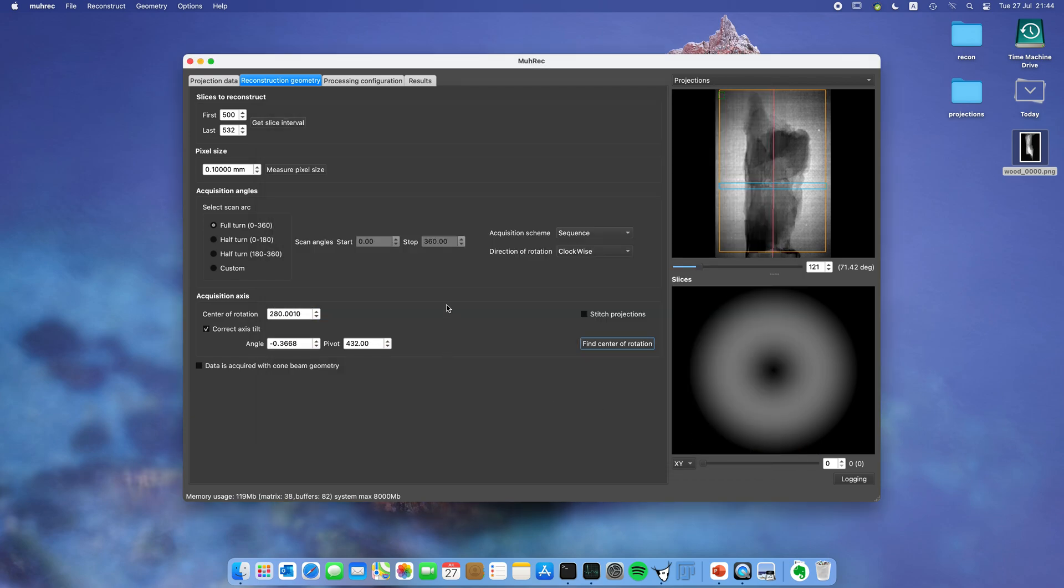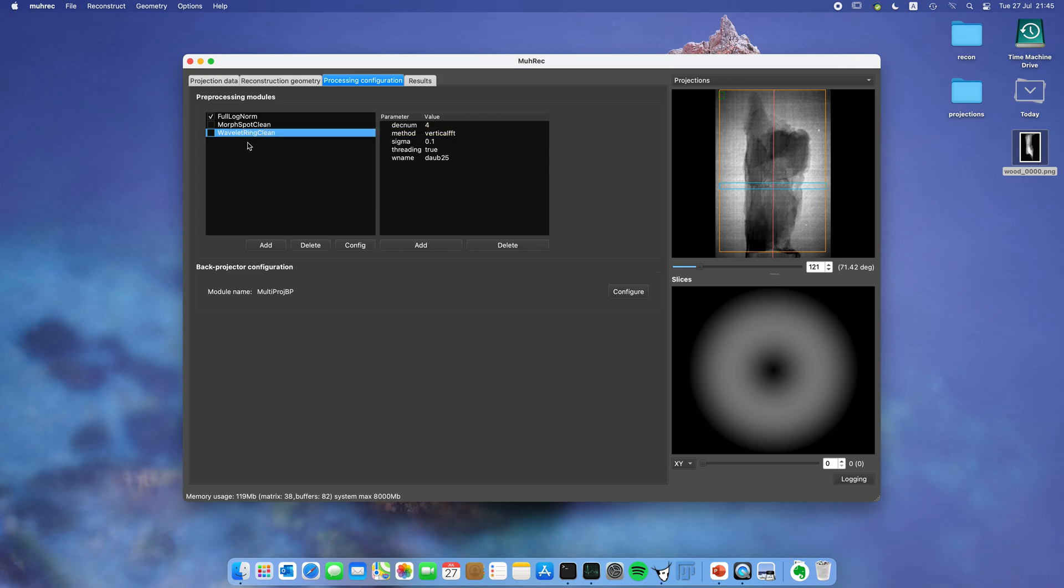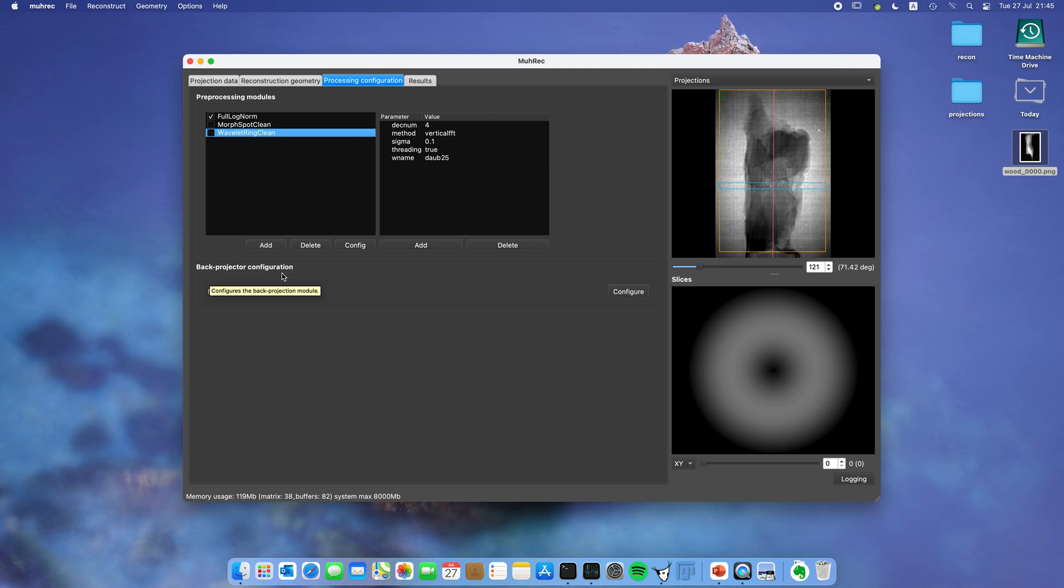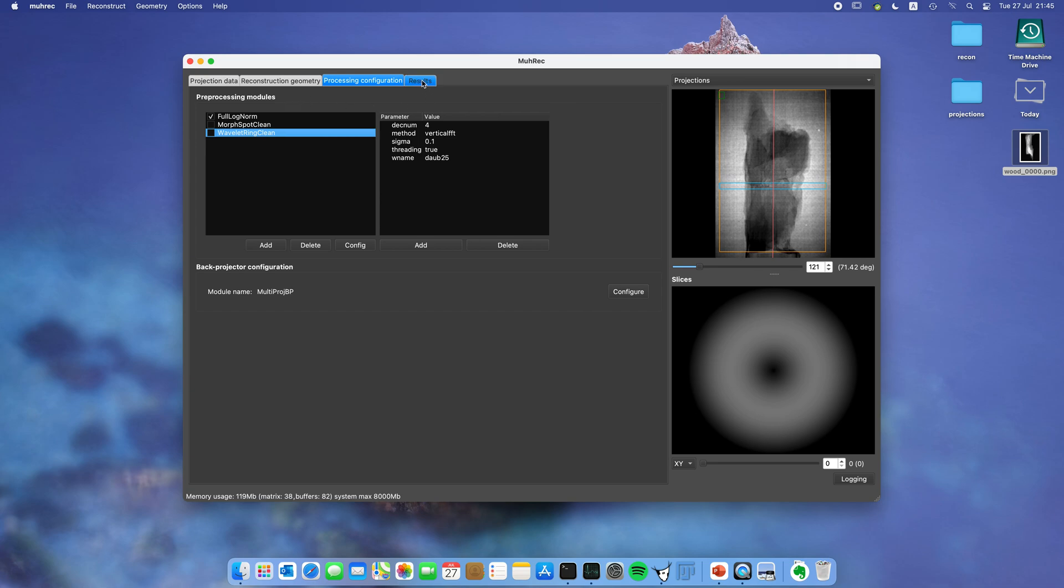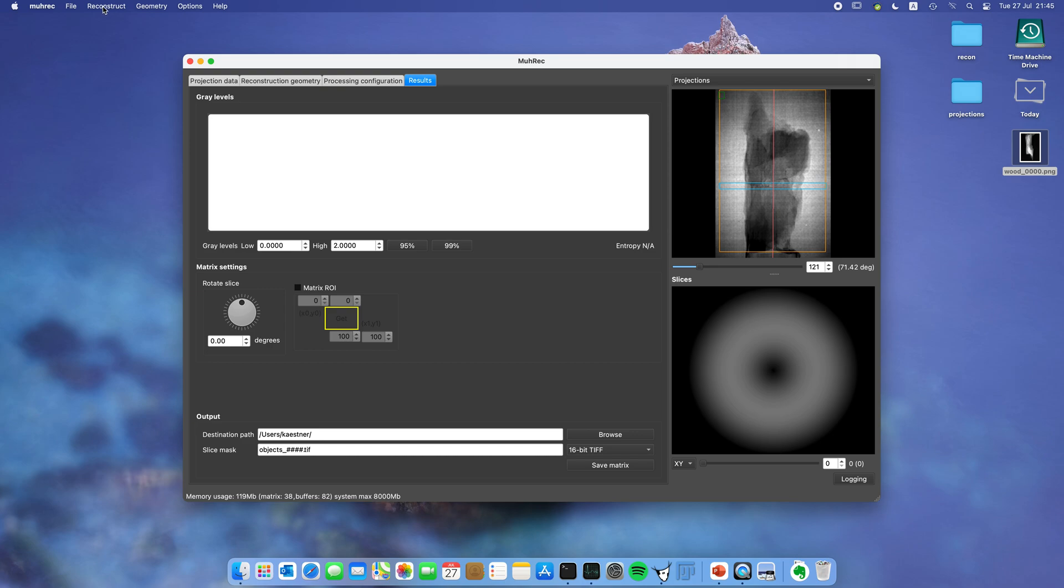With that we are pretty soon ready to do the first reconstruction. I just want to show you that we have some pre-processing modules. In this case we have one called full log norm which actually reverses via Lambert's law computing optical thickness images. Then there are some correction algorithms we're not going to use in this case. Also down here you have a back projector configuration. In this case I've used one called multiproy vp. You can just keep the default value and it's fine. Then we can move on to the results tab. As we haven't started reconstruction yet the histogram is empty and you still have some dummy image over here.